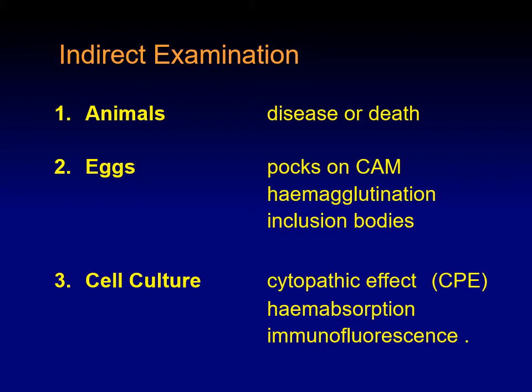Again, the use of eggs really meant that it will take quite a long time for us to identify the virus which we want to isolate from a patient, and moreover it takes quite a large number of eggs for that purpose. If we have 200-300 patients, that means that we have to keep on infecting those eggs and keeping them in a good condition and so on. So this is sometimes not that practical in these terms. So the idea came to some scientists, why don't we use cells?